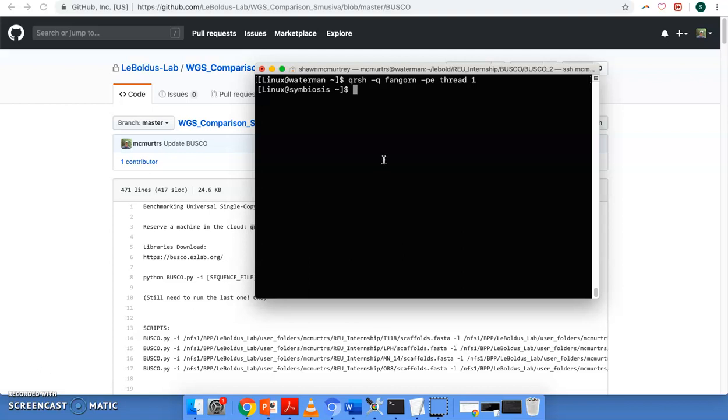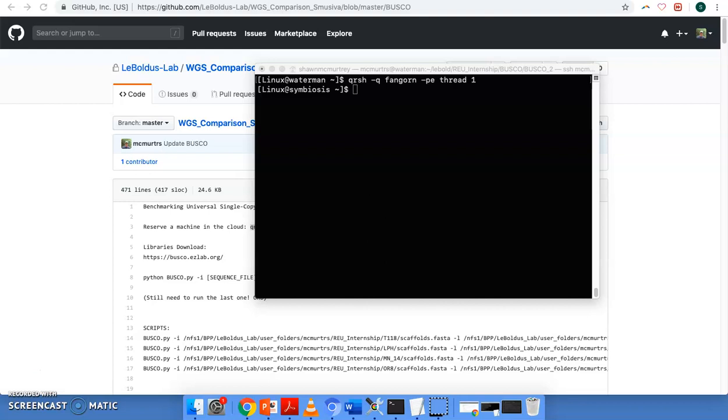And this program has a lot of moving parts. It relies on several other programs. It relies on Python, NCBI Blast, another program called Hammer, and it also relies on Augustus.